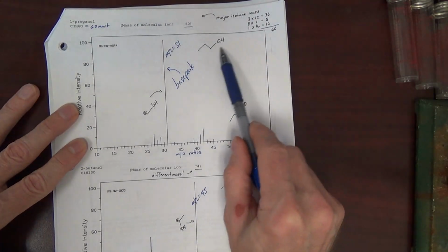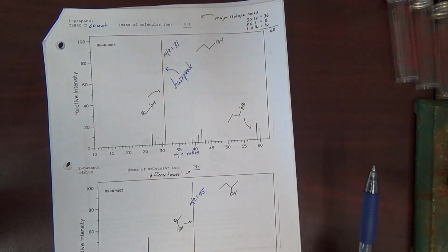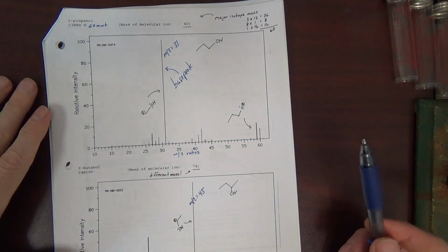Now I've already assigned it. I'm telling you that this mass spec is this alcohol. But in the future we'll be able to know that on our own, or at least should.